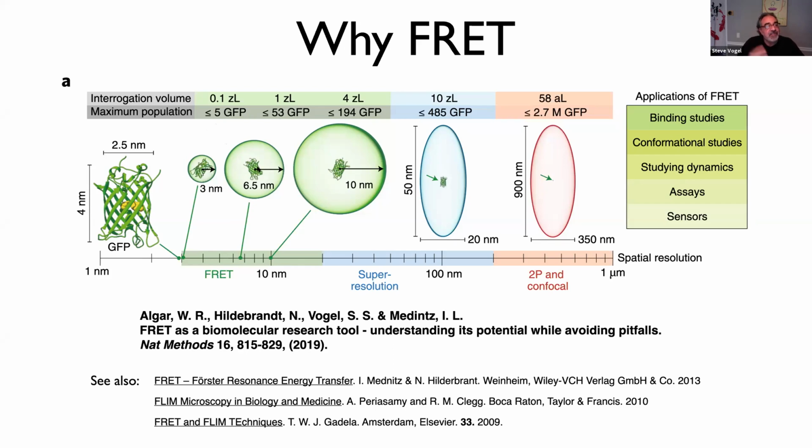And because of this reduction in the volume, the meaning is the same. But I'll stress over and over again, even when you do a FRET experiment, let's say you detect a red molecule that was here on the surface of the sphere, it does not mean that these molecules are interacting with each other. It just means they're within a certain proximity of each other. Okay.